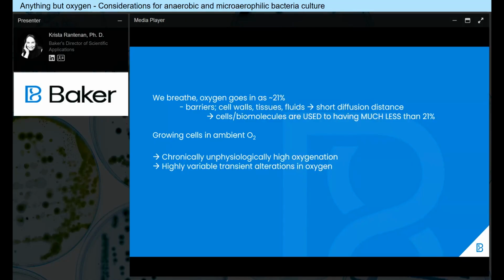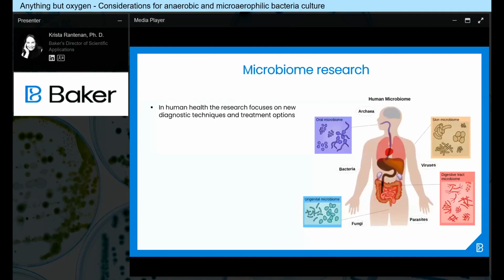So now this goes back to our topic today, for instance, the study of microbiome in the gut, how important it is to actually appreciate that the conditions where we conduct these experiments have to consider oxygen. And in many cases, it has to be also anoxic.